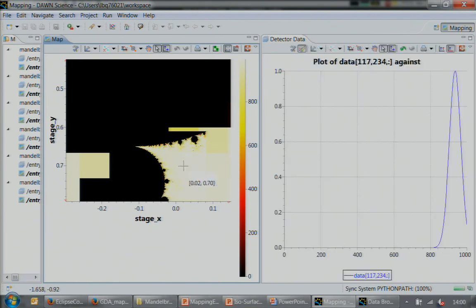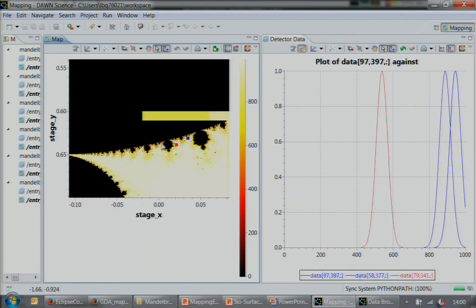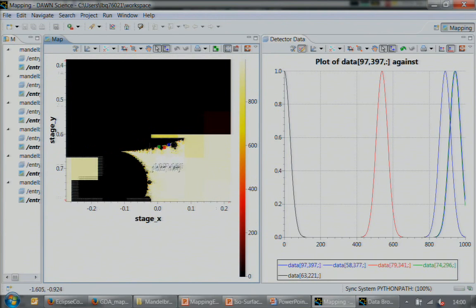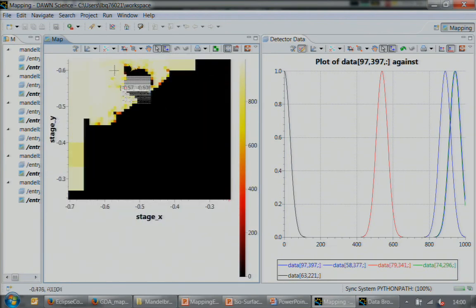With an earlier version of the detector, I recorded some points with a 1D data block behind, so this will happily handle 2D data behind, but also 1D. So this now has lines. And actually, I can click on several points, and it will overlay the lines for different points while showing me where they were, which is actually quite powerful as well for comparison.